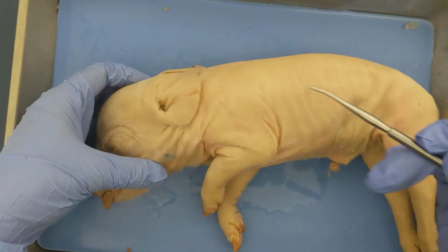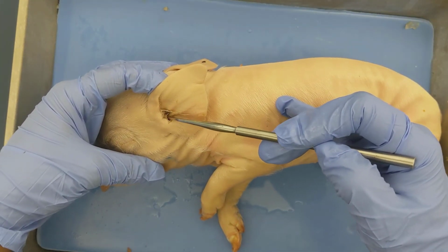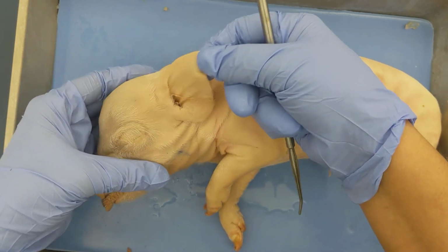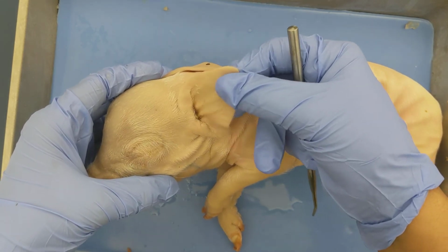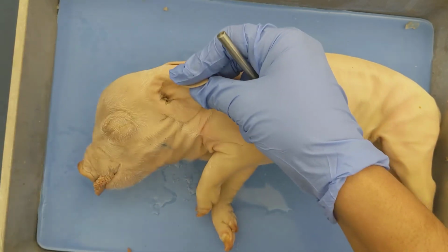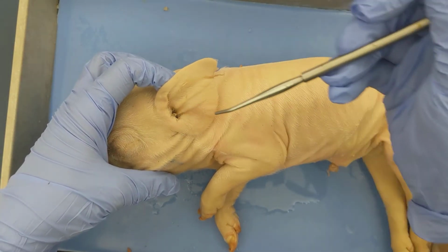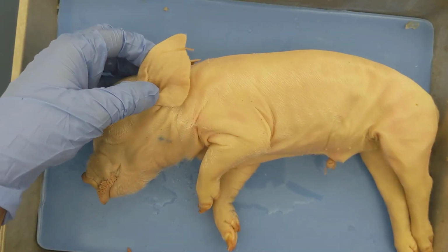There are ears, so the ears are led through this canal. You will enter into the inner ear. This flap of tissue on the outside, this is called an external auricle. We as humans, our outer ear, that's called the external auricle as well, and it helps to collect sound and channel it towards the ear. That's actually technically inside. The part that detects sound is inside.